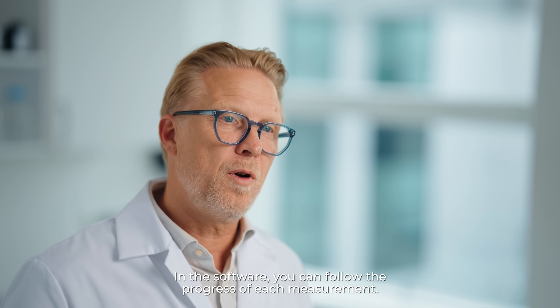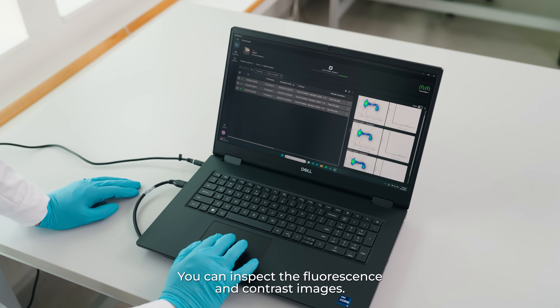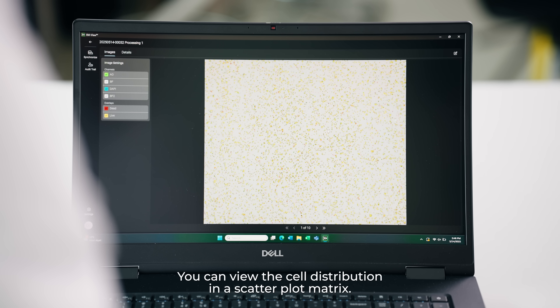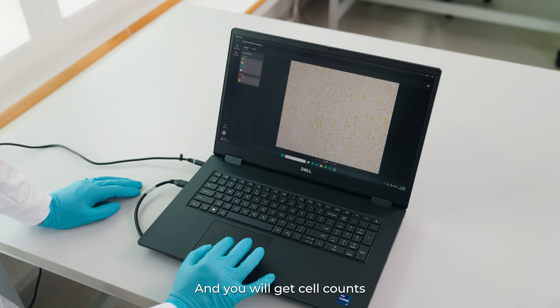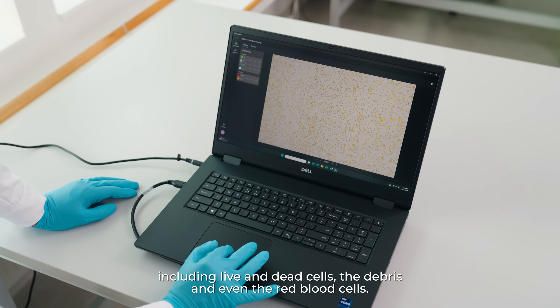In the software, you can follow the progress of each measurement. You can inspect the fluorescence and contrast images, verify the segmentation, and view the cell distribution in a scatterplot matrix. You'll get cell counts — live and dead cells, debris and even red blood cells.